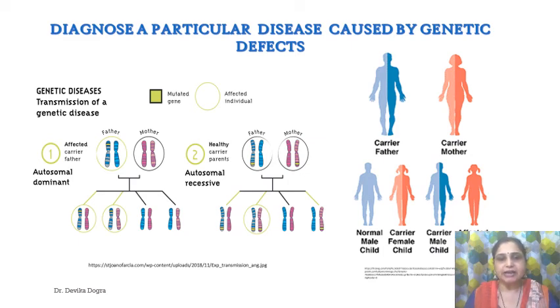A fetus carrying two copies of the mutant beta chain gene can be readily recognized because its DNA will hybridize only with the oligonucleotide that is complementary to the mutant DNA sequence.